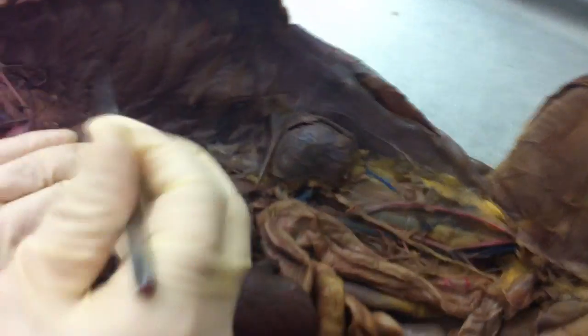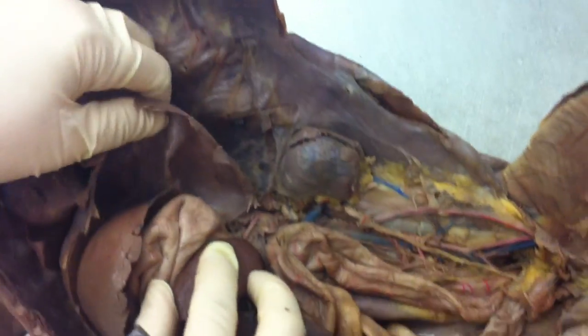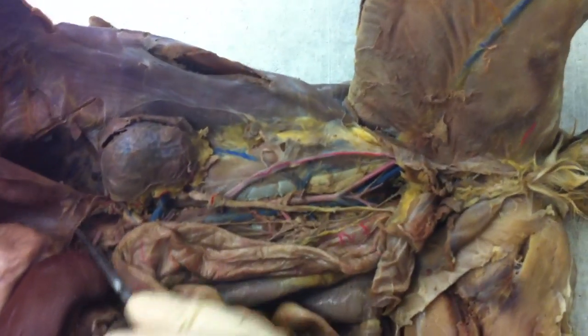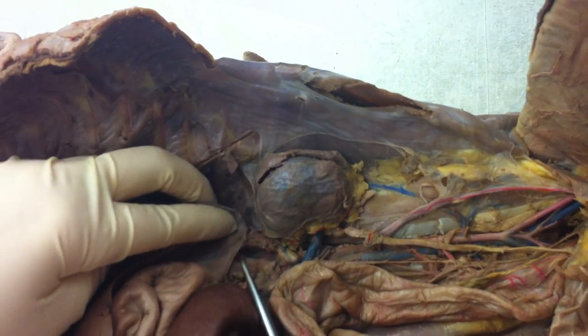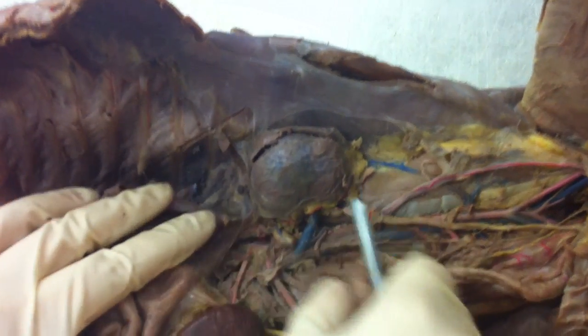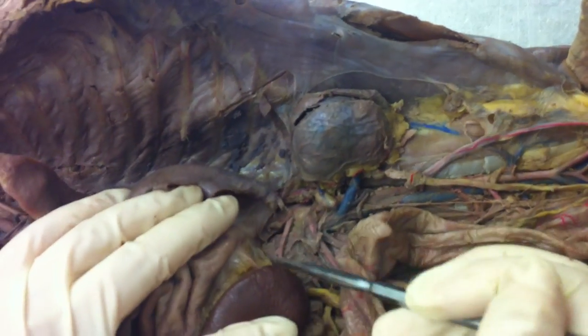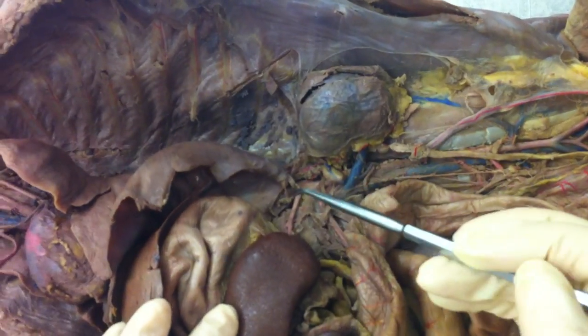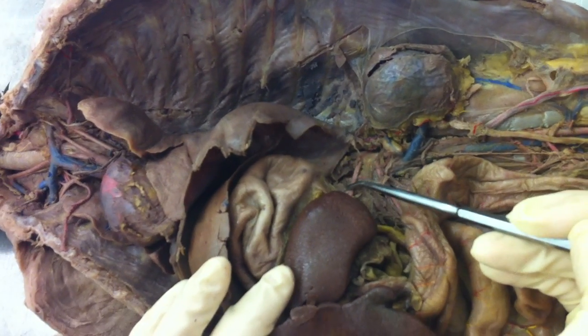So let's go back to that descending aorta. We're going to work our way down through the diaphragm. Here's our diaphragm right here. And you can even see, here's the blood vessel. I'm going to follow it with the probe all the way down. And right after the diaphragm, you can see there are these two that come off of it that run somewhat parallel to each other, right? First one, right after the diaphragm, is called the celiac trunk.